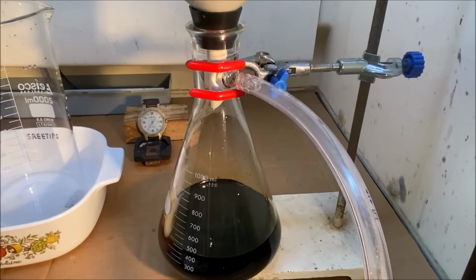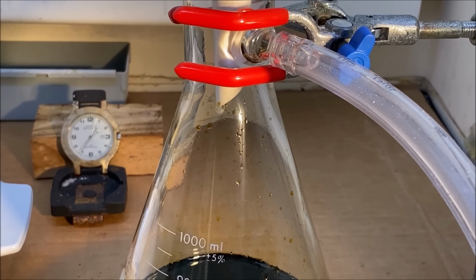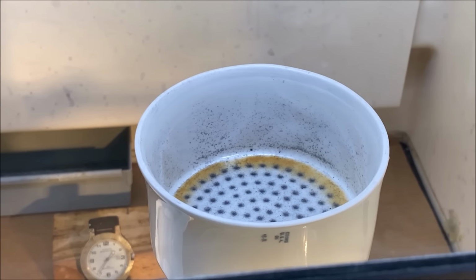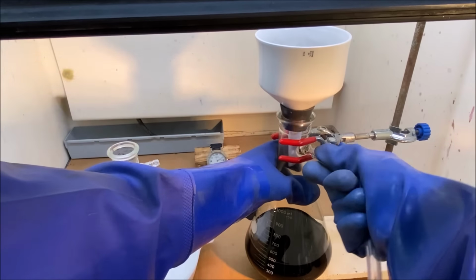Okay, if you look, the filtrate coming out of there is running clear now. I've rinsed the filter with hydrochloric acid, so I think our filtering operation is complete. Let's see what we got on our filter here.